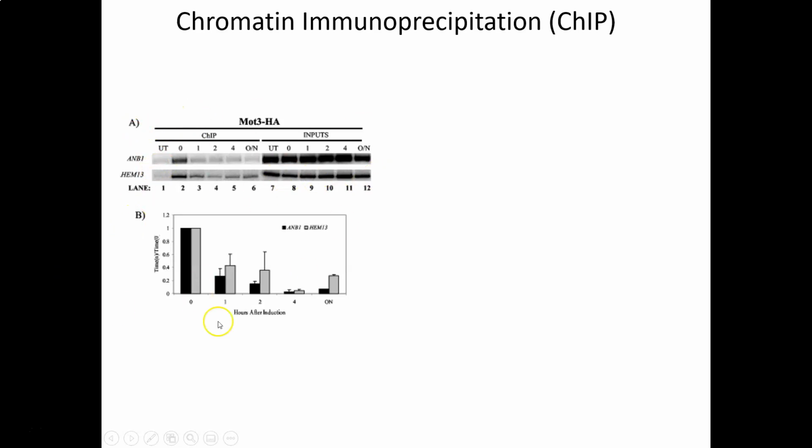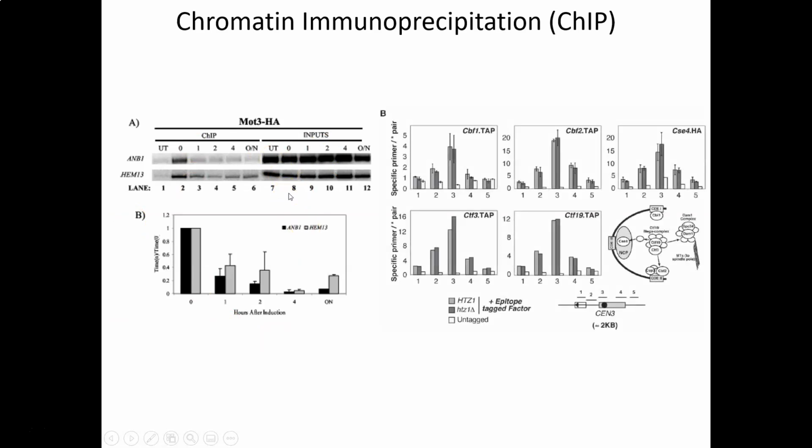This is a ChIP from a paper that I was lead author on. But ChIP is done a little bit more high-tech now. This is from the paper that you are reading this week. Here we're immunoprecipitating for centromeric proteins and actually looking at the impact of histone variants on the centromere formation. So we've got this kind of sliding scale of PCR amplicons, of PCR primers. Region number 3 is a PCR product right over the centromere.